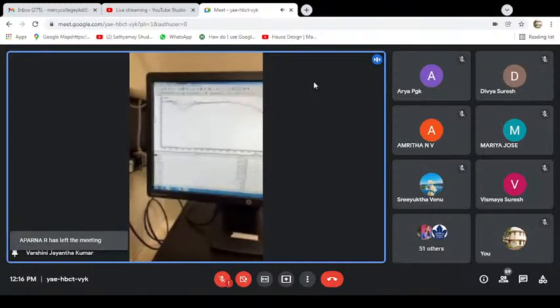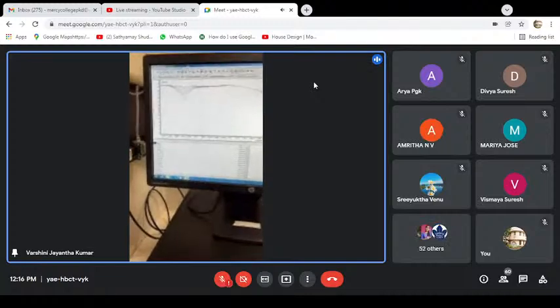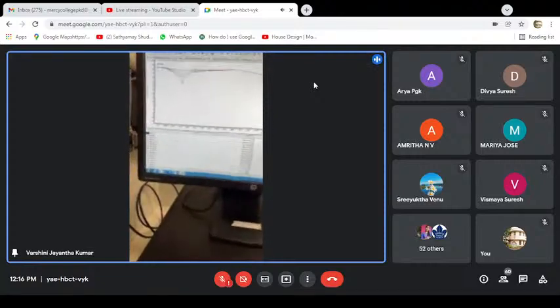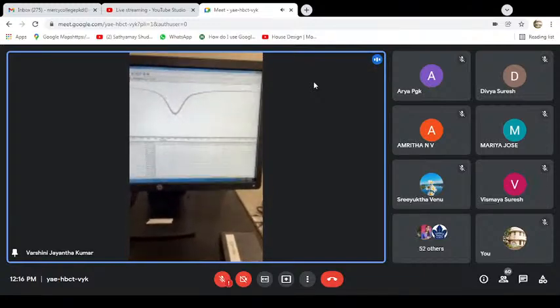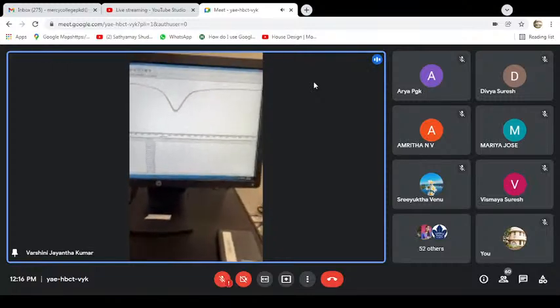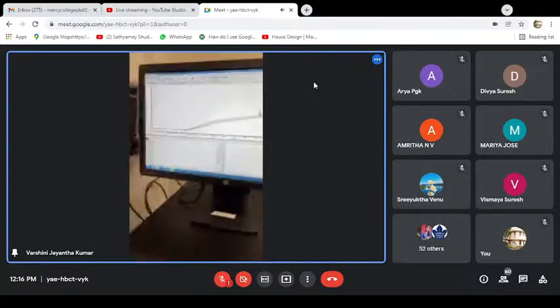Upon oxidation, electrons transfer through the molecule, causing a change to the electron density and the dipole moment of the bond. When electrons pass through, the C triple bond C loses its triple bond character. So we see a disappearance of this band, and at the same time we get another band over here, which indicates that the C triple bond C has shifted into a band of double bond character. That's how we indicate the structural changes with spectroelectrochemistry.